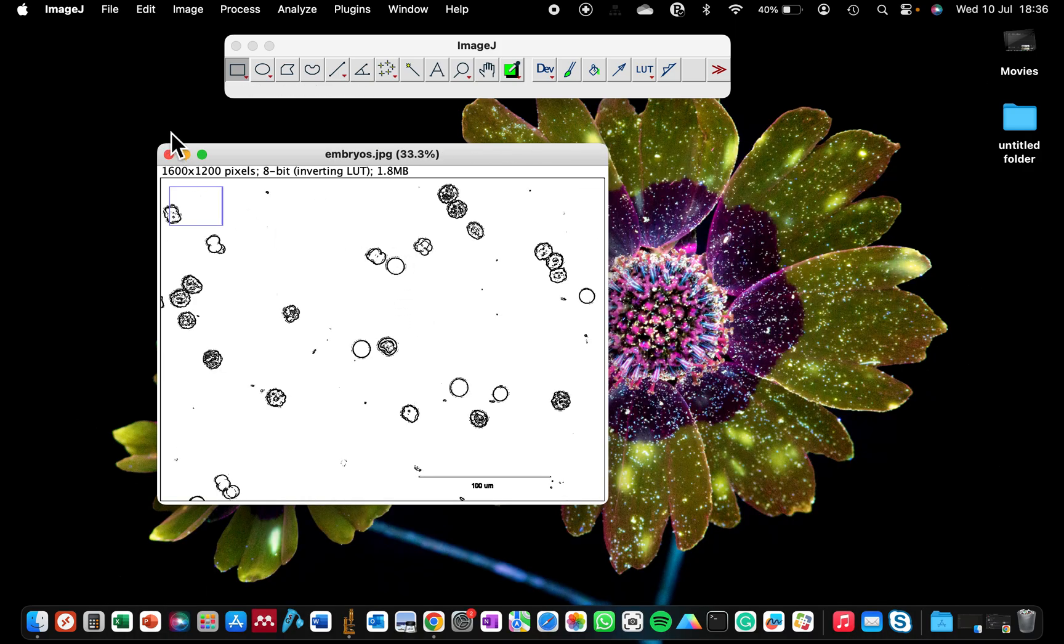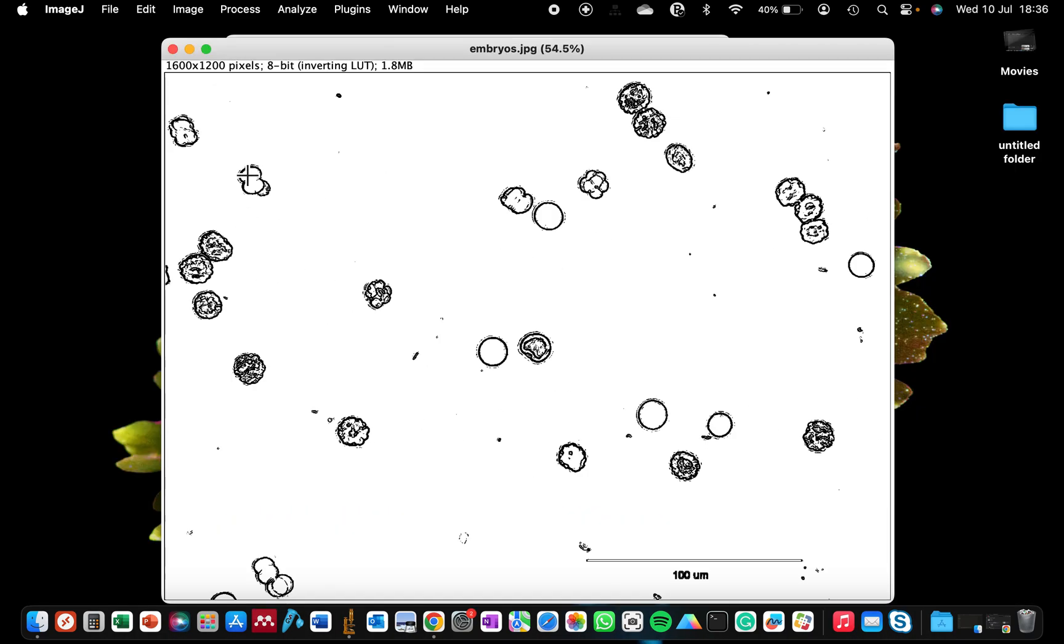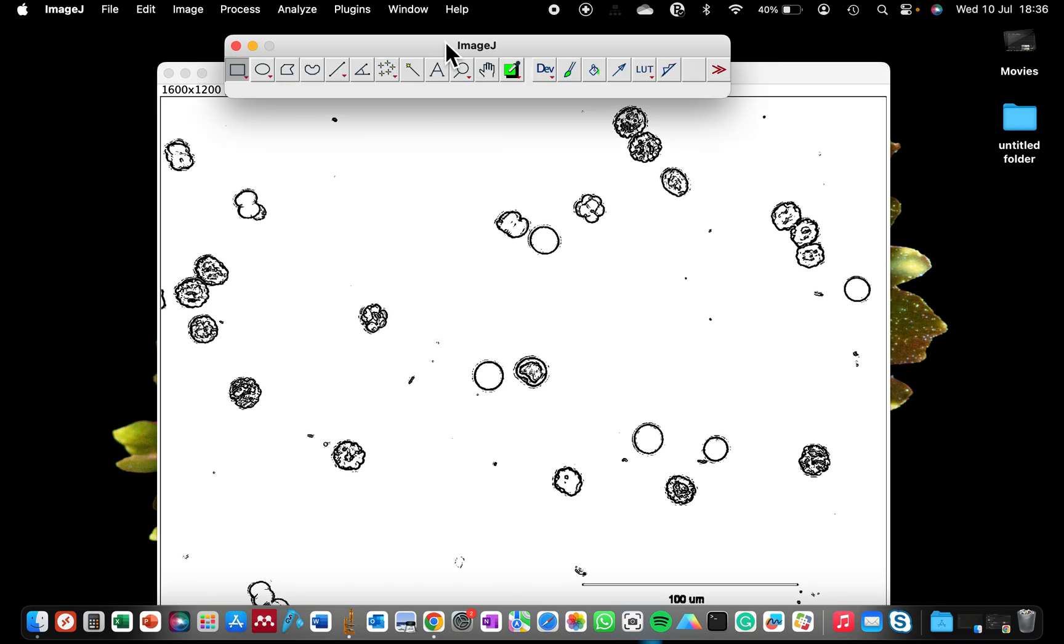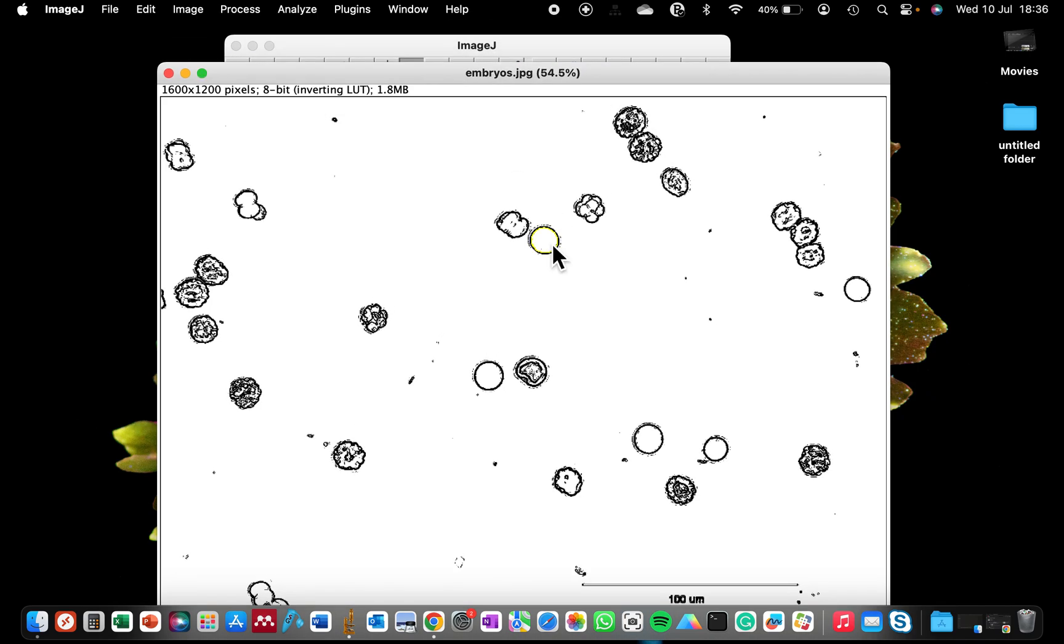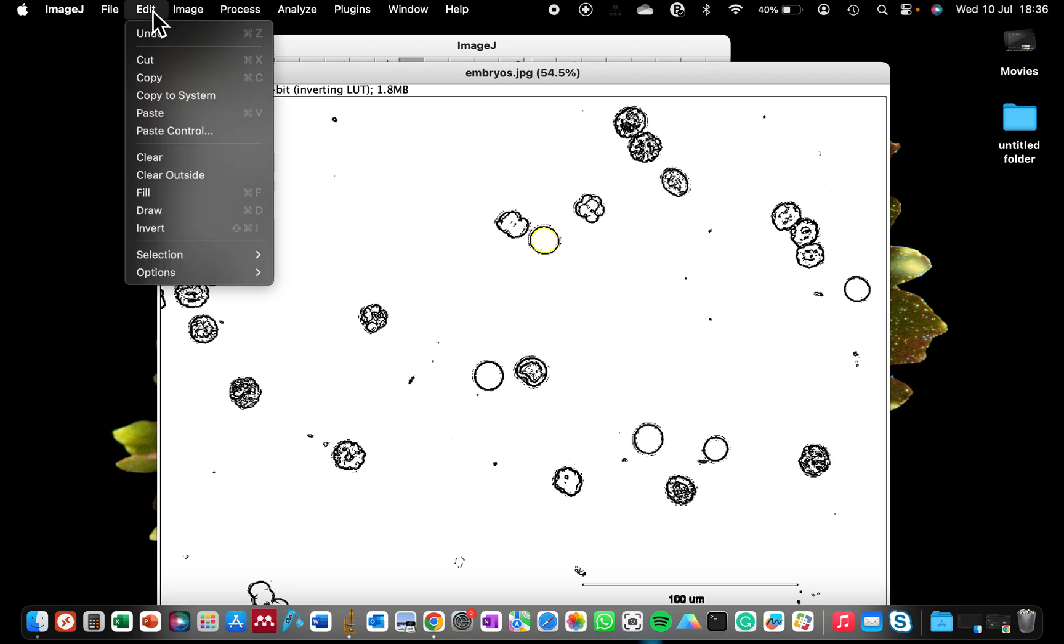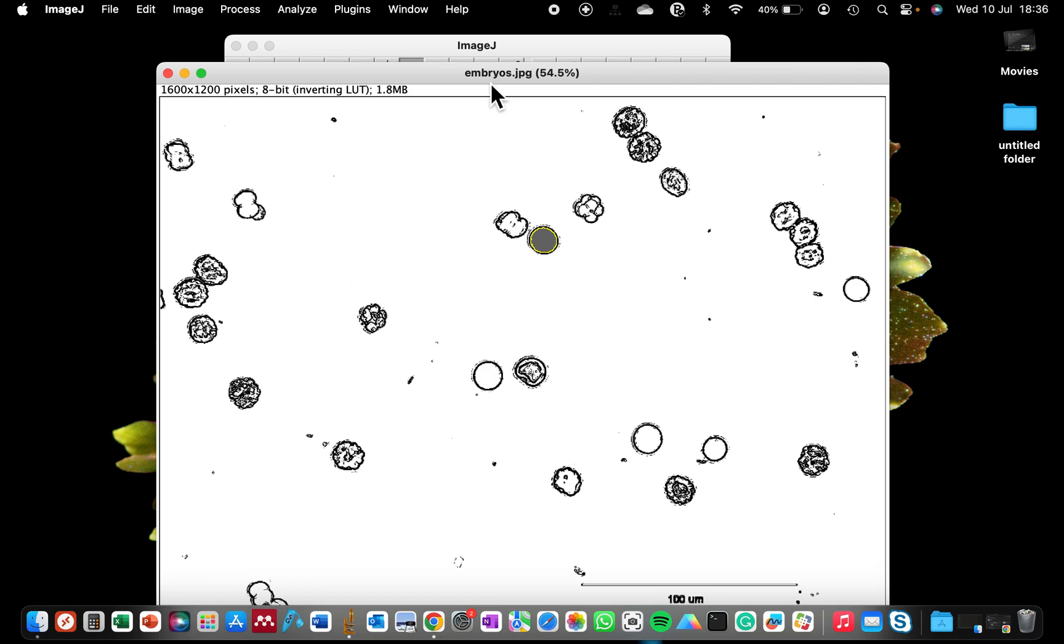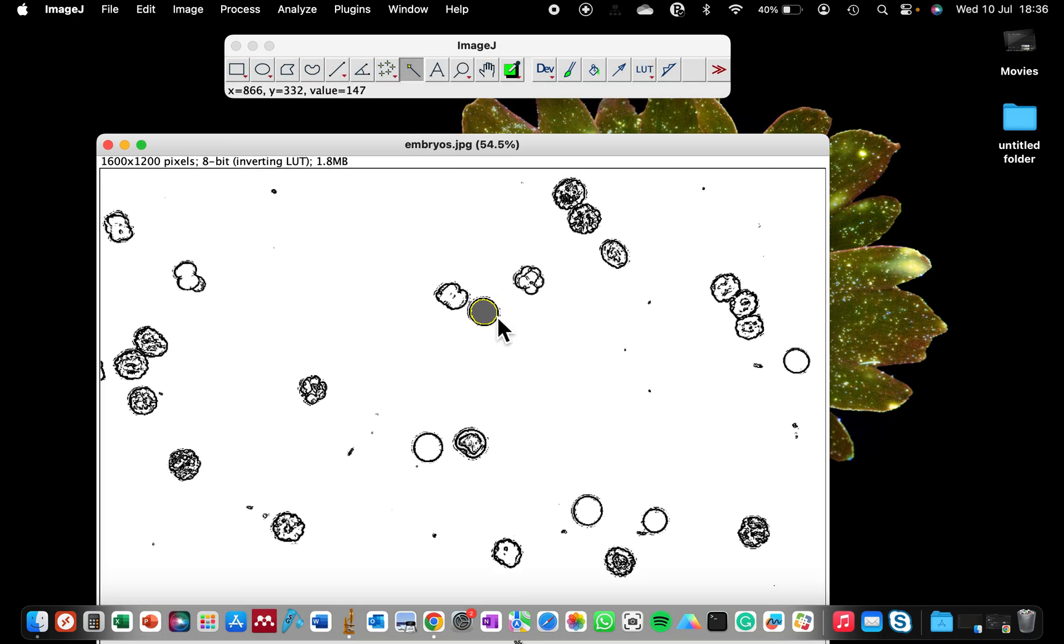Once you've selected the cell you want to fill, go to Edit and select Fill. This will shade the image, the cells for you. So now you can see that one has been shaded.